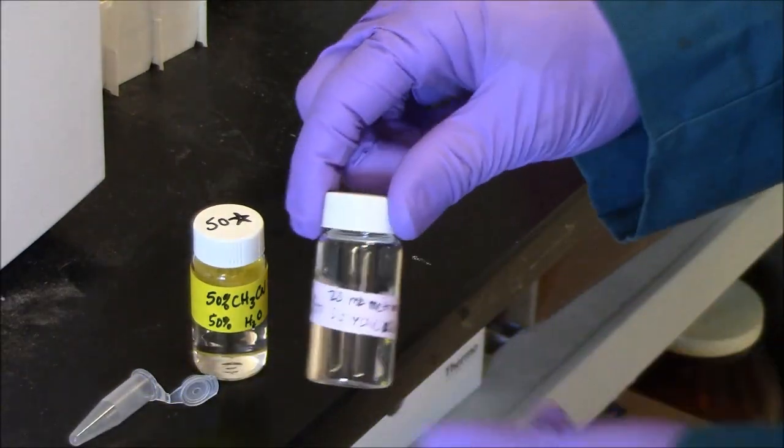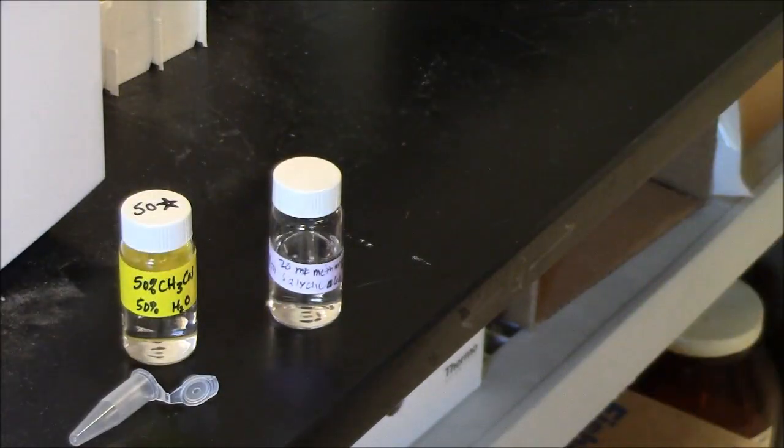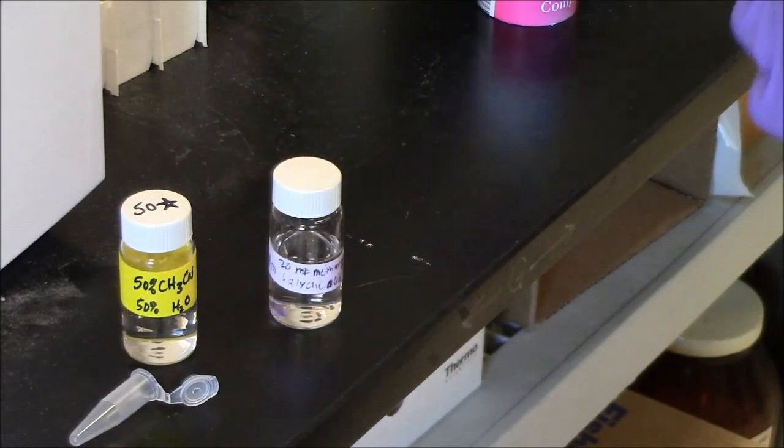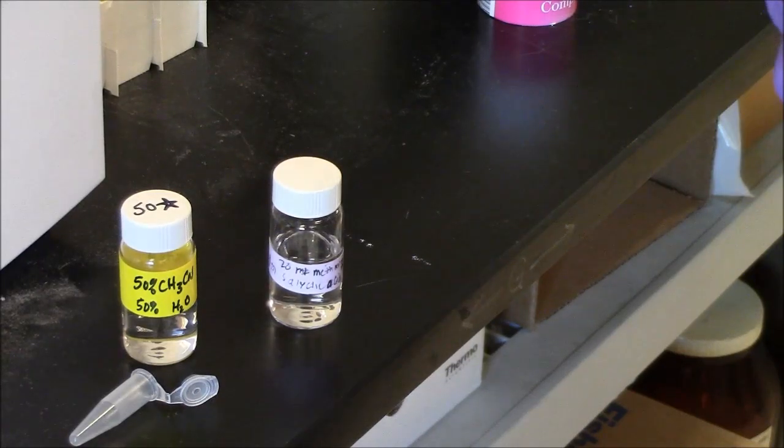I have here a stock solution of 0.1 molar salicylic acid. To make the dilution, I'll do a 50-fold dilution, which will make the concentration in the Eppendorf tube 2 millimolar.